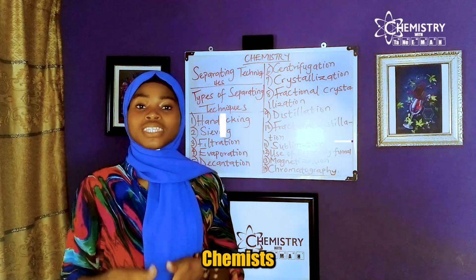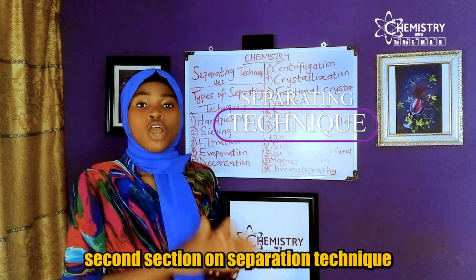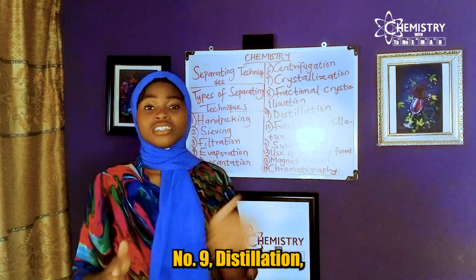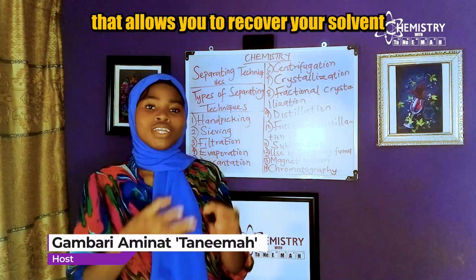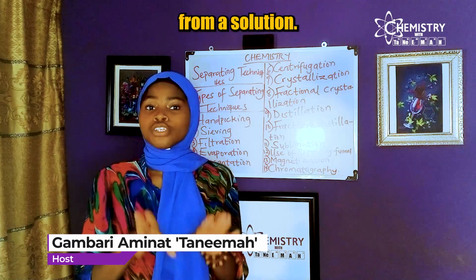Welcome back, chemists, to the second section on separation technique. Number 9, distillation. Distillation is a separation technique that allows you to recover your solvent from a solution.